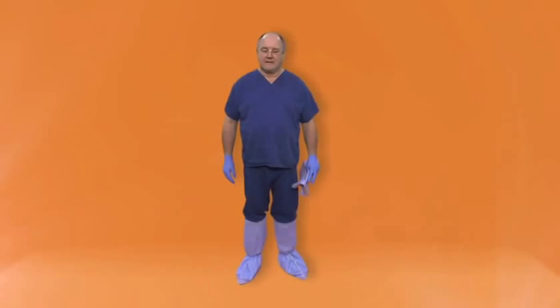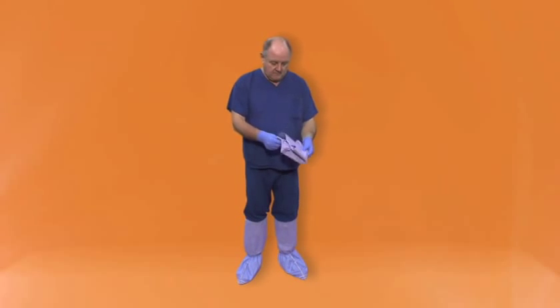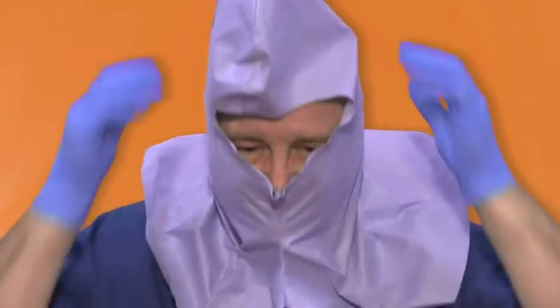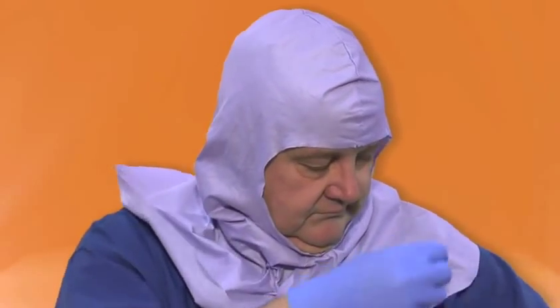Hood. If you wear spectacles, remove these before donning the hood. Don the hood with the V-shape at the front. Once the hood has been fitted, replace your spectacles if worn.